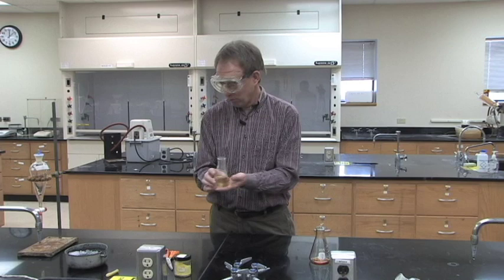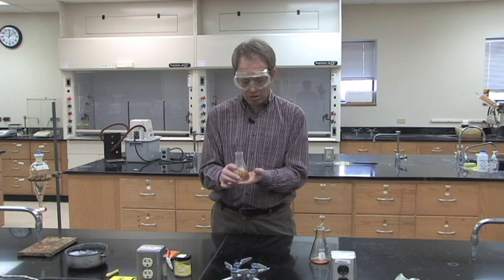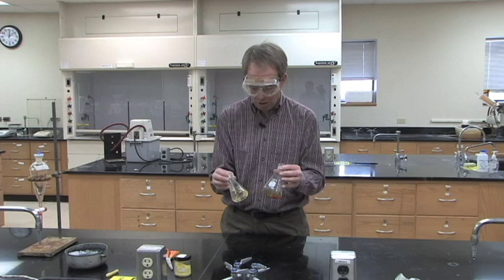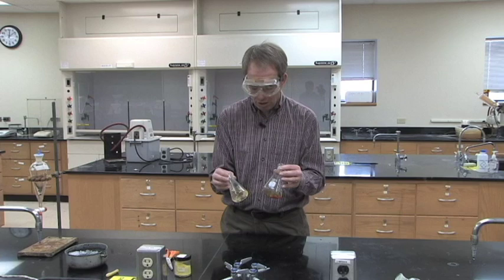Filter the precipitate through your Buchner funnel with the vacuum aspirator, just like last week's lab. Once you get to that point, stick it in your drawer and let it dry until next week, then do the melting point on it to identify what your unknowns are. Note that different instructors will have different samples, so you won't necessarily have an orange sample and a white sample depending on who you have for organic lab.